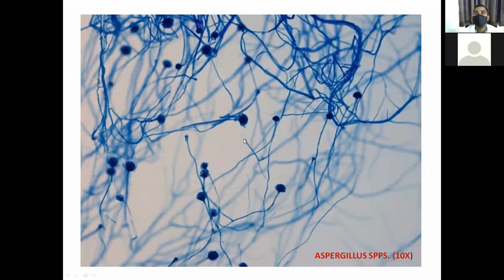Now, after observing this demonstration, sir showed very clearly how to prepare a slide culture. Already I said all those steps; sir very clearly had done and shown them to you. After coming back to your regular classes, you will do every practical yourself, and this one also you will observe very clearly.